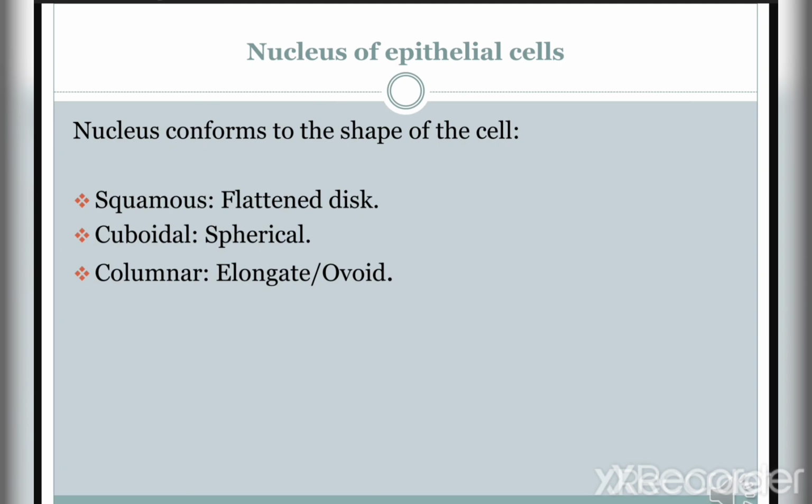If the preparation slide is good, or the technician is skilled, you can see the outline. So it is very important to depend on the nuclei to decide first the shape of the cell, and it helps us also to decide the number of the layers.